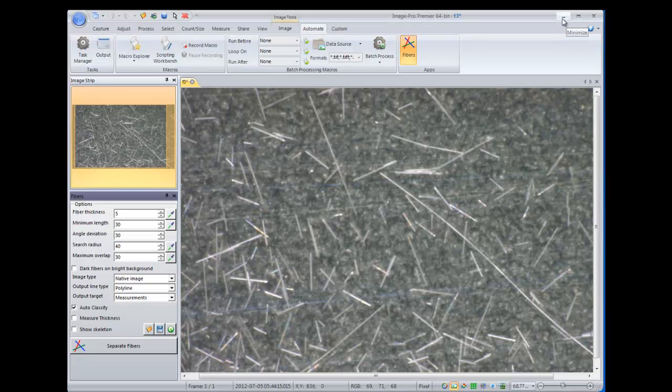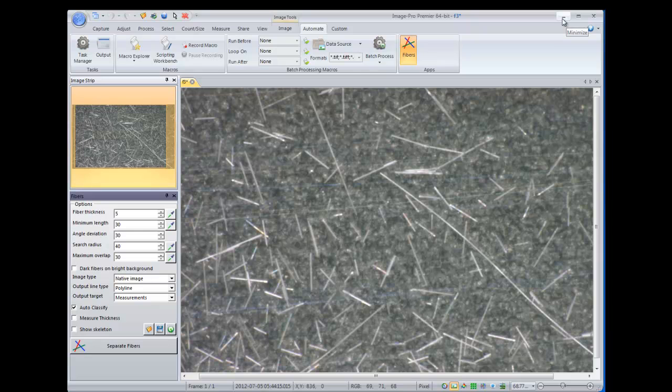Now we'll walk you through the app. An important thing to note is that this app was designed for images where you have overlapping fibers, and specifically images where you can see the endpoints for most of the fibers in your images.